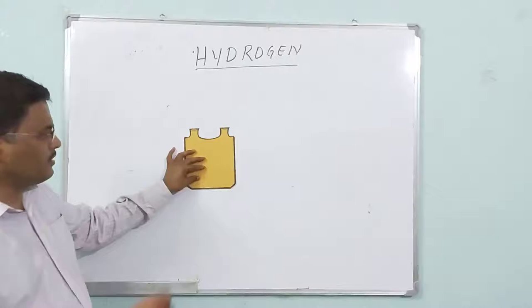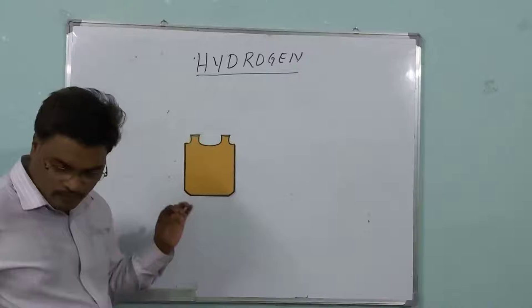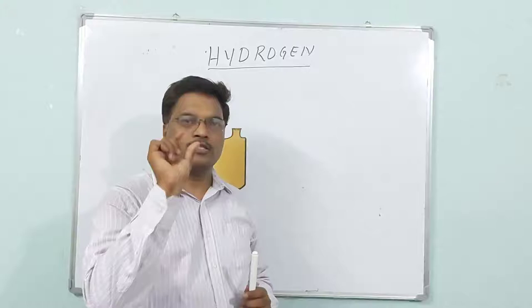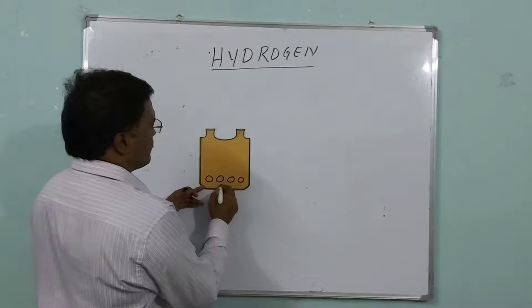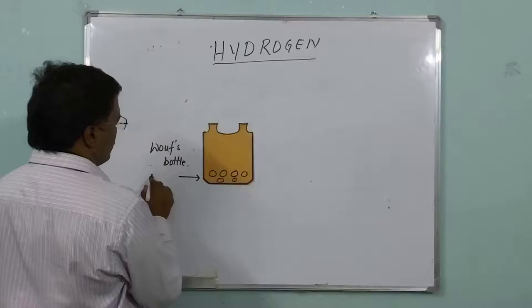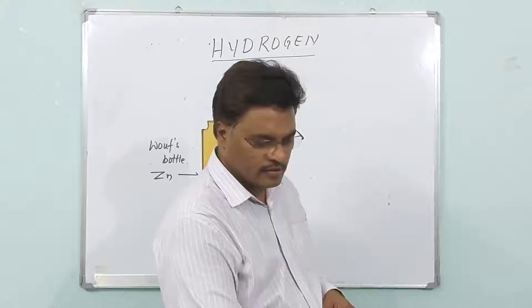We have to take the Wolf's Bottle like this. Inside the Wolf's Bottle, you have to keep zinc pieces — small, small zinc pieces. So this is the Wolf's Bottle and these are the zinc pieces that you are keeping.